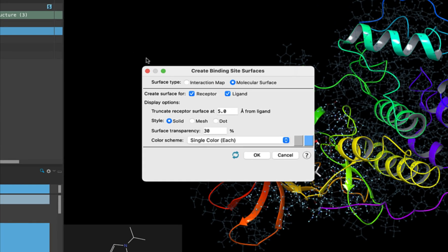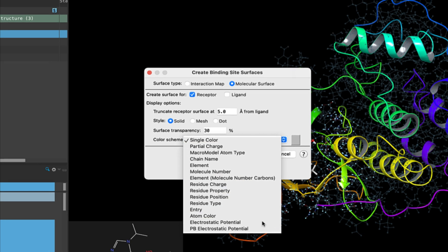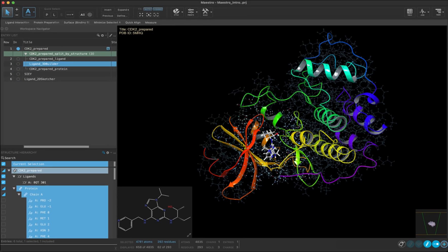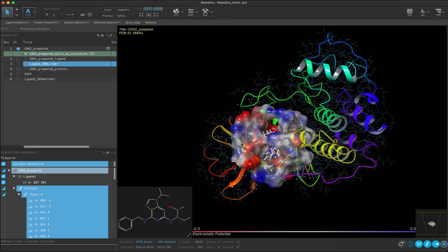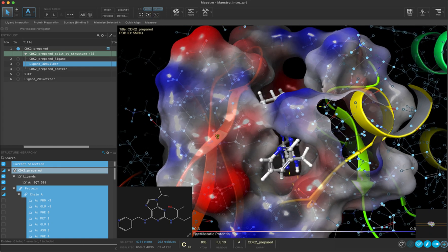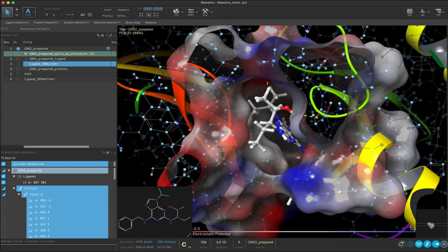Find surface binding site in the Favorites toolbar and click on it. We are going to create a receptor surface that is 5 angstroms from the ligand with a transparency of 30%. The style will be solid and the color scheme will be electrostatic potential. Click OK. Now we have an electrostatic surface that is covering the protein within 5 angstroms of the bound ligand. This can give us helpful visual information about the ligand binding site. You can rotate the molecules in the workspace to explore the surface.